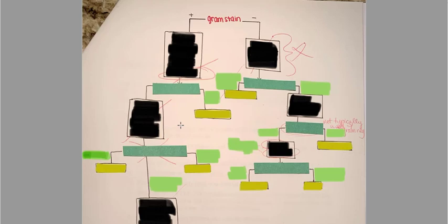So you can see that if the person indeed had a gram-positive organism and then did this test by week 2, they would have done gram stain on week 1 and inoculated whatever this is here. By the second week, if it was negative, I'm pretending here, they knew that they had this organism. So every single organism needs to be able to be separated out individually.